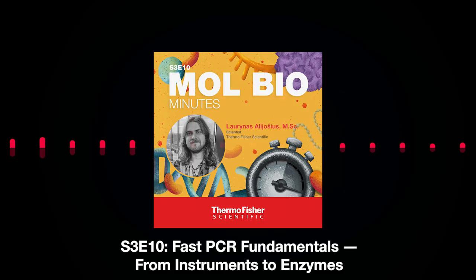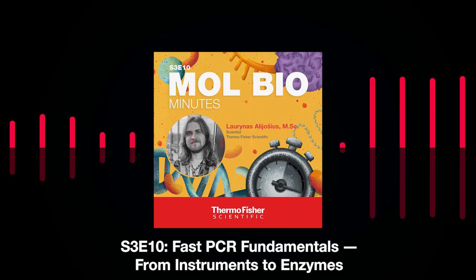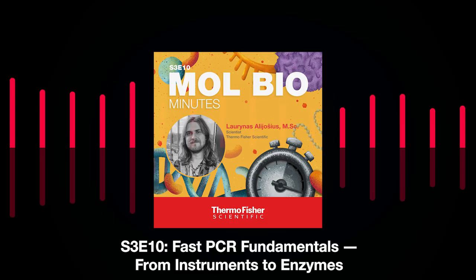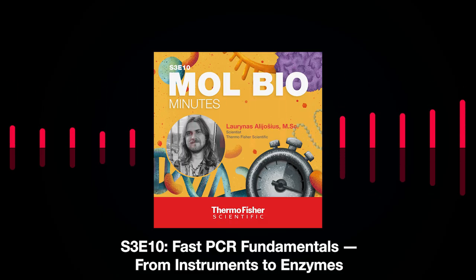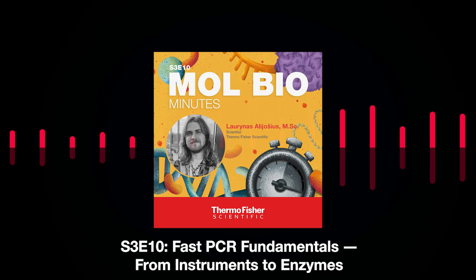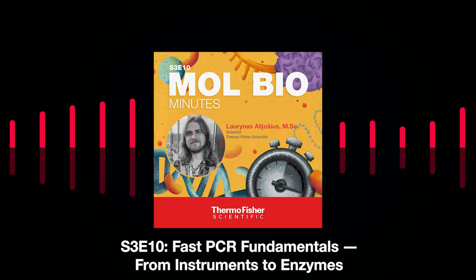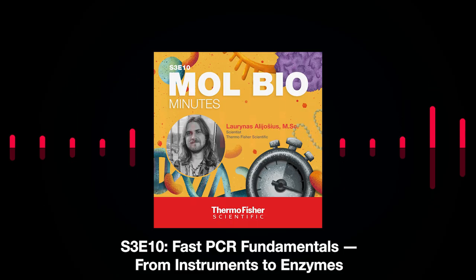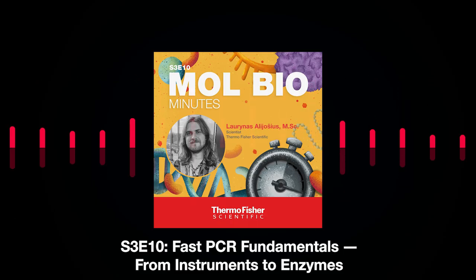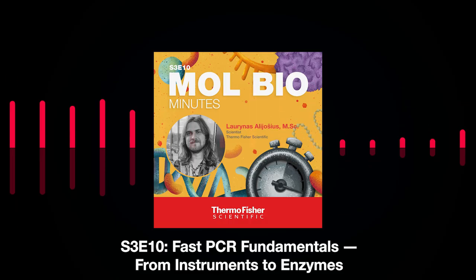In this case, that's where the new engineered DNA polymerases come in with their strong performance, because the advanced engineered DNA polymerases have very short times for each step of the PCR, so you can really cut down the duration of every step if you use the engineered ones.